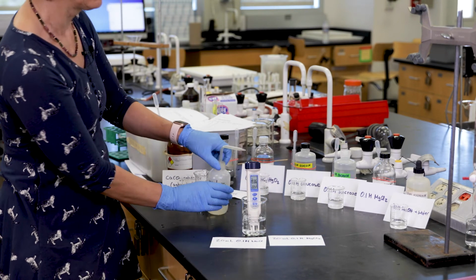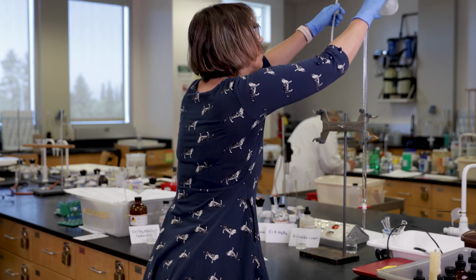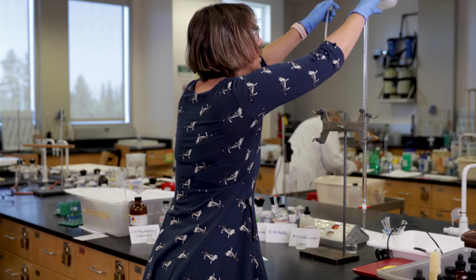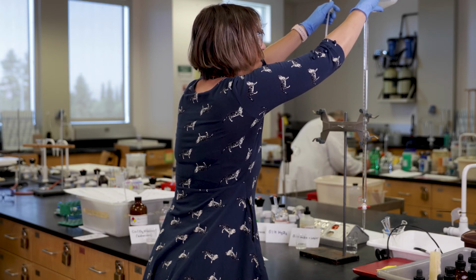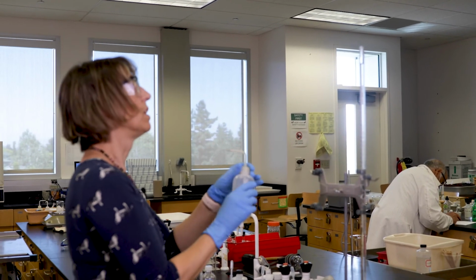Okay, we need to add a few more milliliters of water. We're going to continue using that burette. Need to refill it. It only contains 50 milliliters. There we go. It's pretty exact.